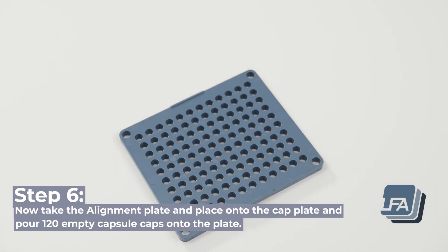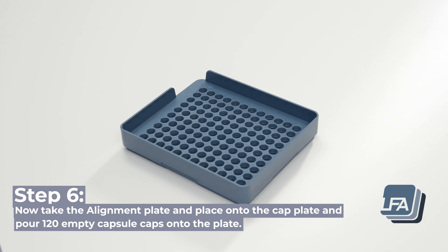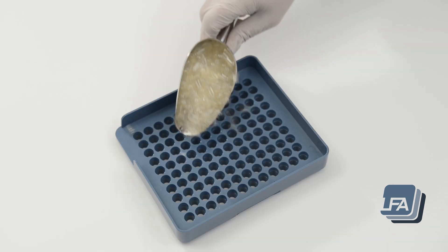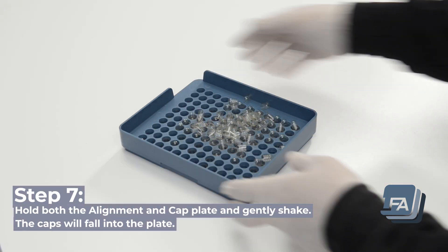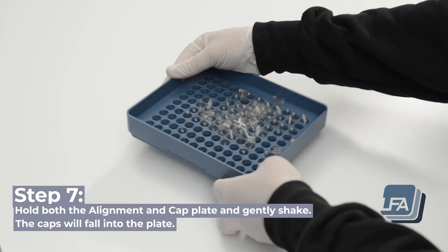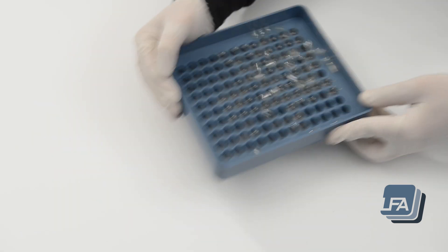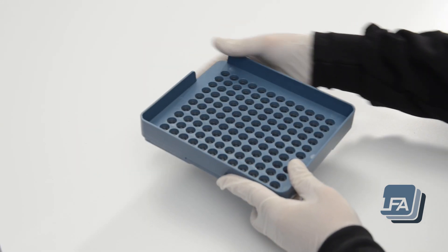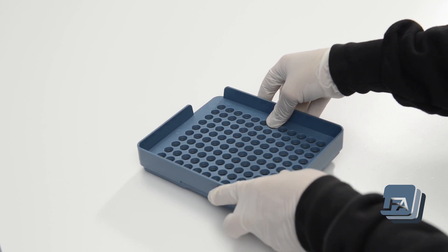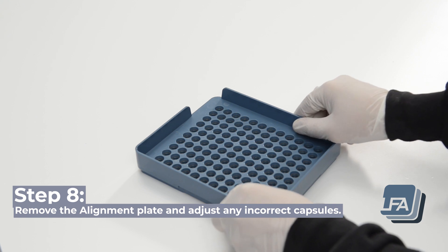Step 6: take the alignment plate and place it onto the cap plate and pour 120 empty capsule caps onto the plate. Step 7: hold both the alignment and cap plate and gently shake — the caps will fall into the plate. Step 8: remove the alignment plate and adjust any incorrect capsules.